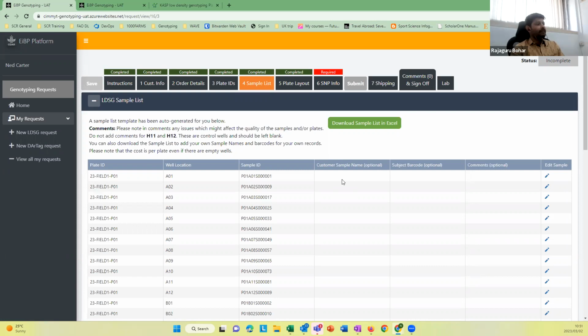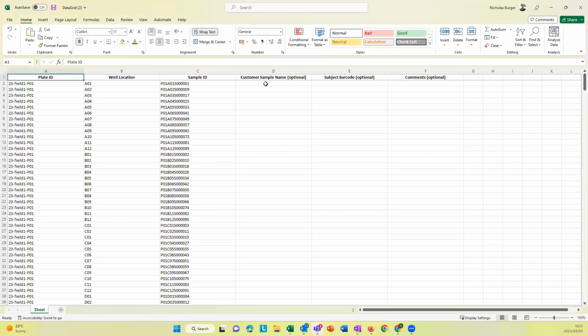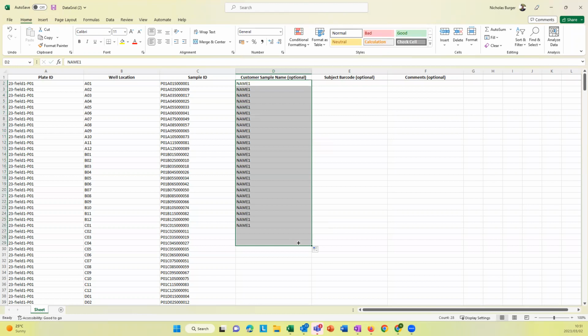Yeah, you can. Go ahead, Jim. In that case, Ismail, if you wanted to give a lot of sample names to track yourself, then you would download the Excel sheet and copy and paste your names into the relevant columns as you normally would in Excel. So you can track them in that way. As we said in the chat, Ismail, you can see on the screen, you can download just the sample list Excel, but you have to keep exactly the information as it is, so you can't change columns. It's just a matter of copy and paste, but you have to be very careful. It's something that we can improve later.